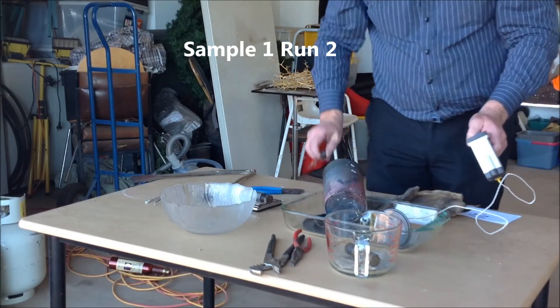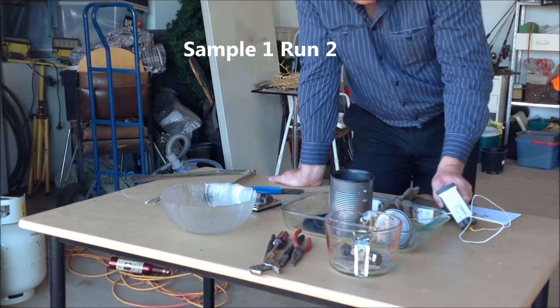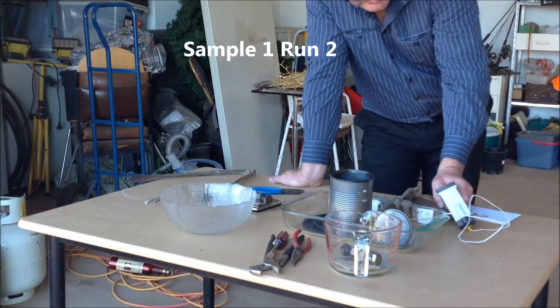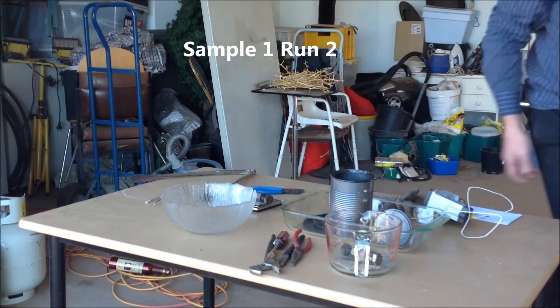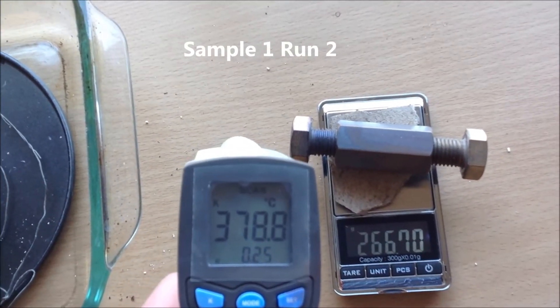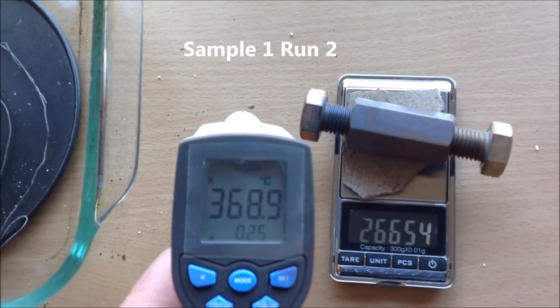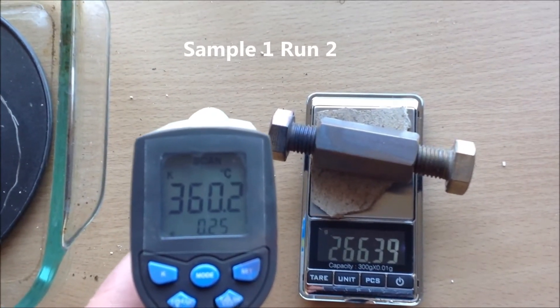410, 267.19. 400, 267.05. 390, 266.9. 380, 266.74. 370, 266.57. 360, 266.40.